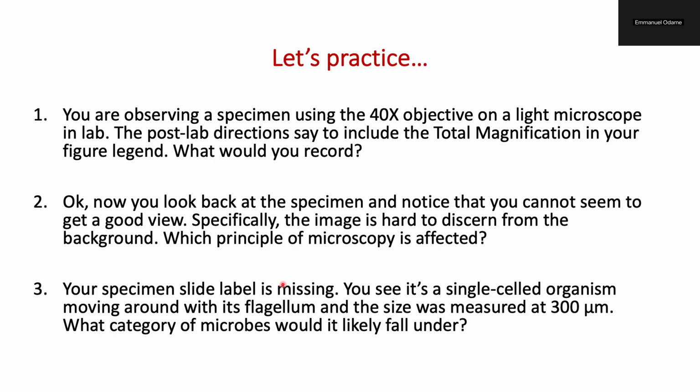Yeah, so that should be contrast, because you need to be able to tell the object from the background. And then your specimen slide is missing and you see a single cell organism moving around with flagellum, and the size was measured around 300 micrometers. Which category of microbes will you likely think it falls under?